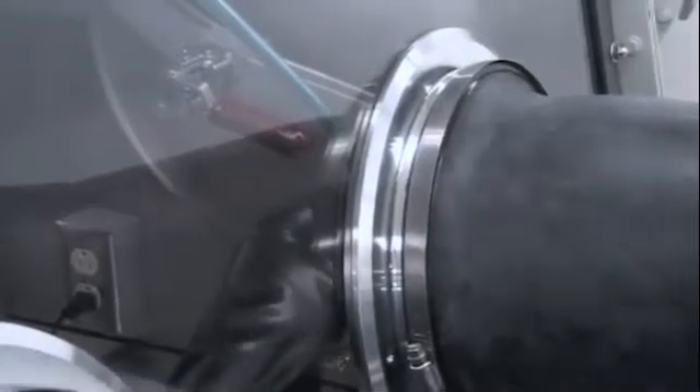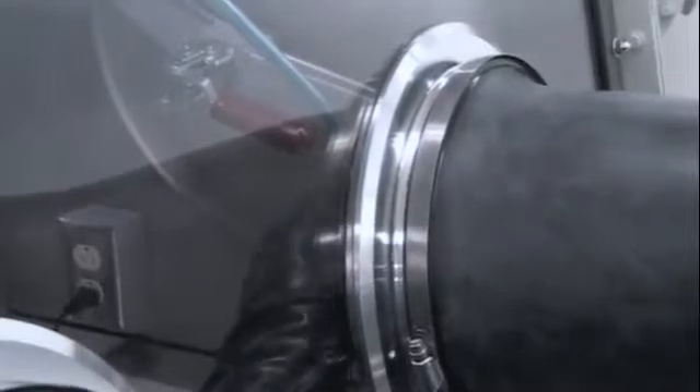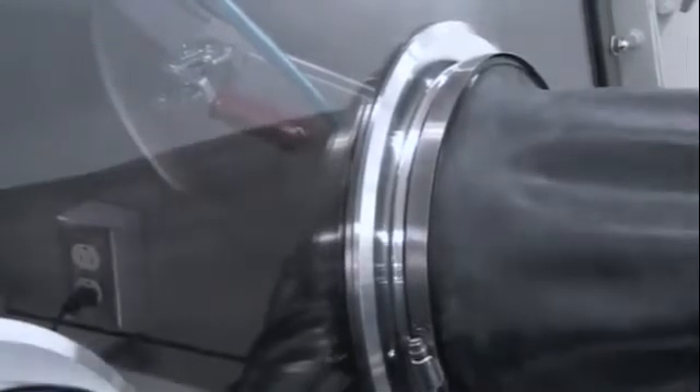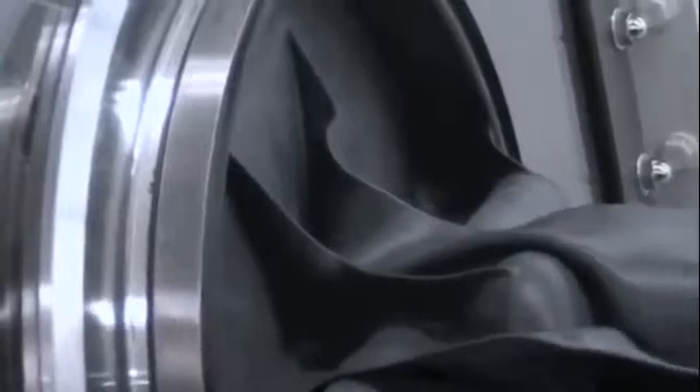You can see the glove is pretty limp as we pull vacuum on it. We are going to repeat this step between three to five times to leave a clean atmosphere in the glove.